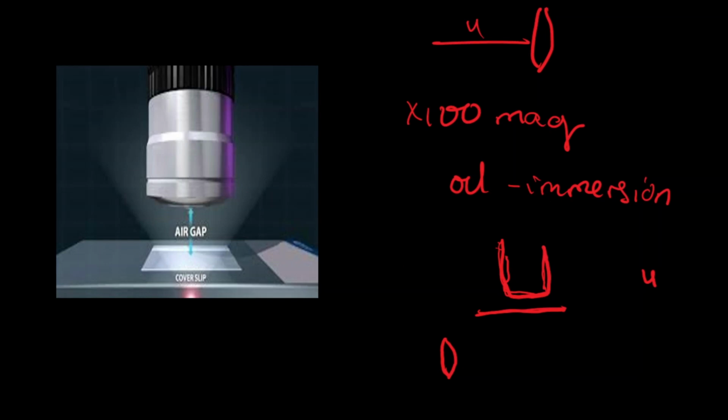Okay, however, this refraction is because the light is going from air, which is of a lower optical density, into this glass. Now, because the objective lens is very close to the slide, the oil immersion or the immersion oil is applied here. Okay, so it's just applied on the slide, usually where the cover slip is covering the tissue slice. It's applied there in order to reduce refraction.